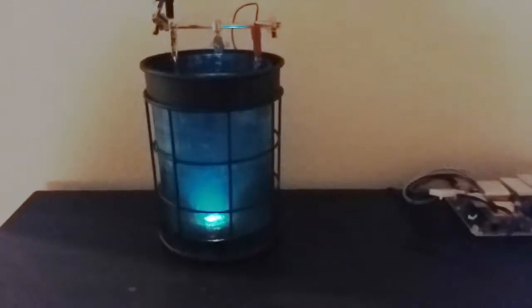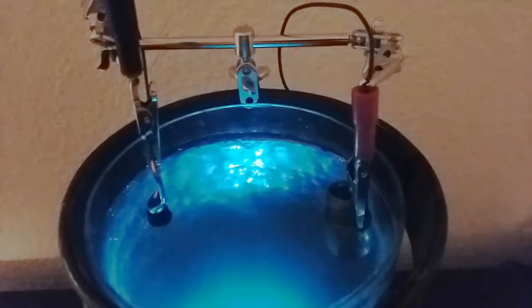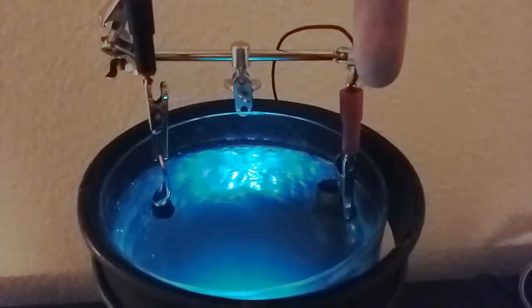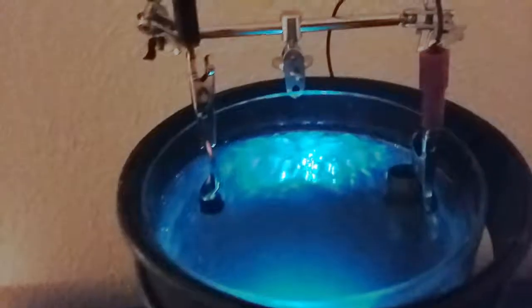This is my copper crystal growing setup. The light at the bottom is just aesthetic so it looks cool and sciency. We've got the anode over here which is acting as our source of copper, and the cathode over here which is accepting it. I only just plugged it in and you can already see small crystals growing. Pretty freaking neat.